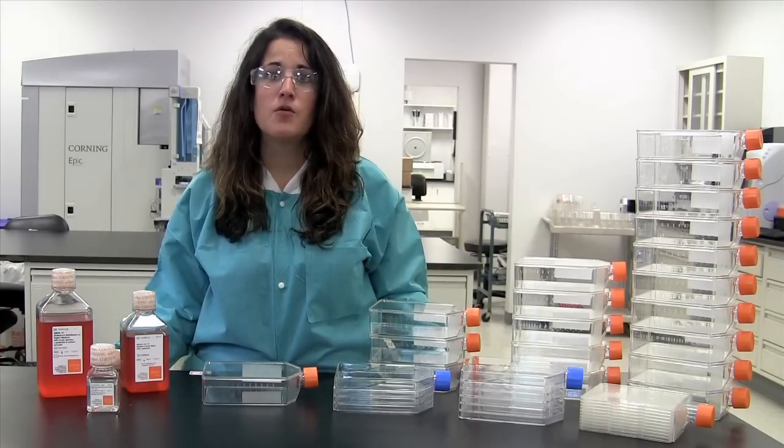For adherent-based cultures, not all cell culture vessels have the same growth area. When expanding cells, it's easier to expand into larger vessels by calculating cells per unit area. Therefore, you can expect your cells to be at the density you want, when you want, regardless of what vessel you culture them in. To seed based on cells per cm², use the formula found at the bottom of the screen.